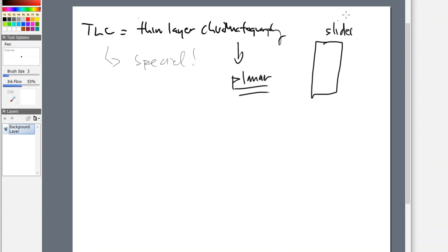So a very, very flat surface, and if I draw the plate to the side, okay, so here's the plate, there we go, and there's a little bit of stationary phase that covers the surface of that plate. That plate does not have any hills, that plate does not have any mountains. You can't go on snow trips on this kind of particular type of plate. It is very, very flat, so hence the term planar chromatography. And that's kind of still used today by some old school folks that are still out there, but now we really call it TLC, and that just means thin layer chromatography.